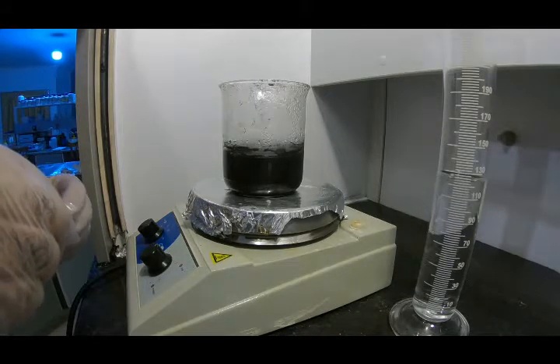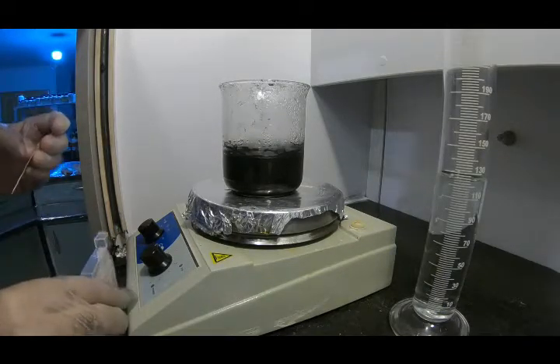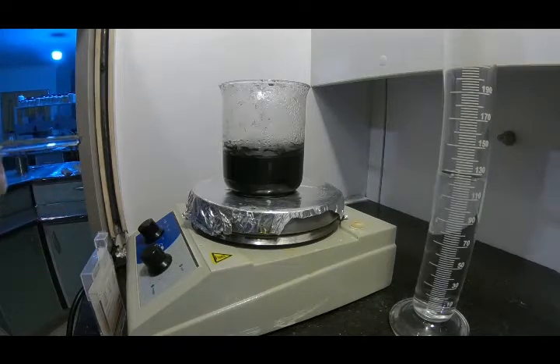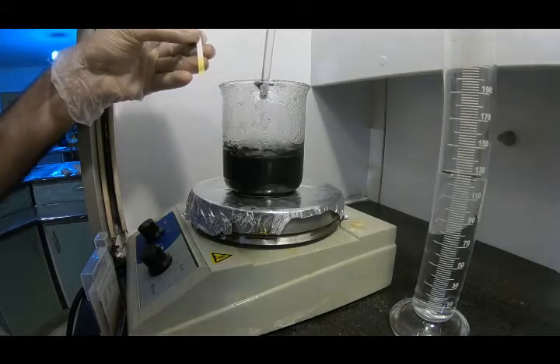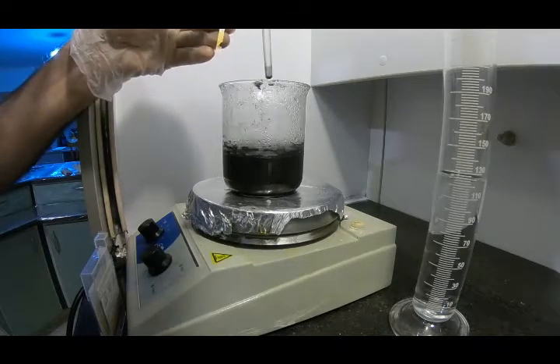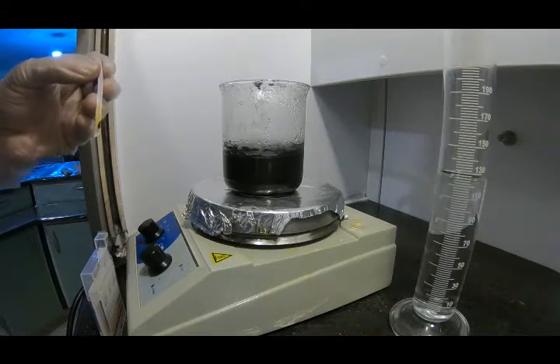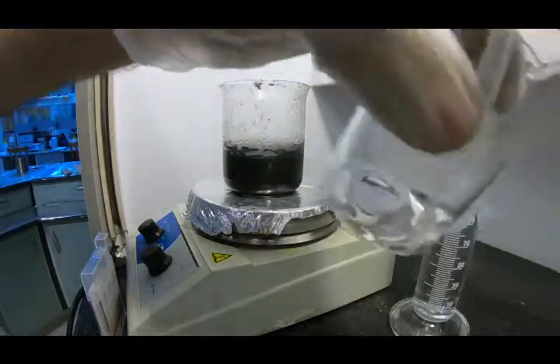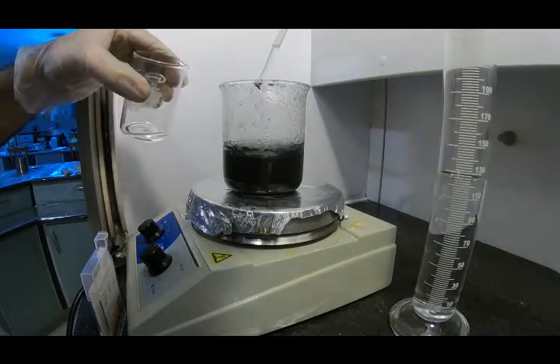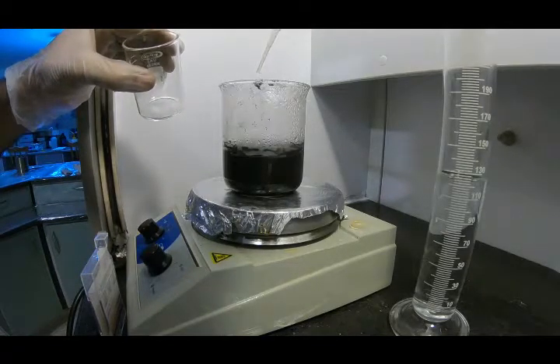Let's check it again and see if we are at the desired pH. As you see, we are acidic, so we are going to add just more. Okay, let's check it again.